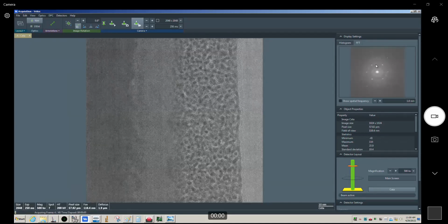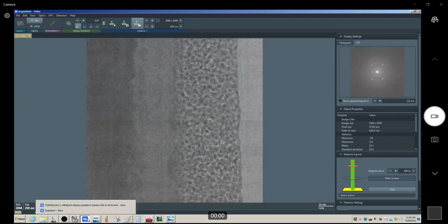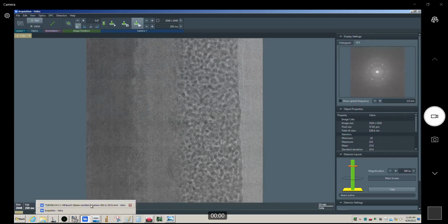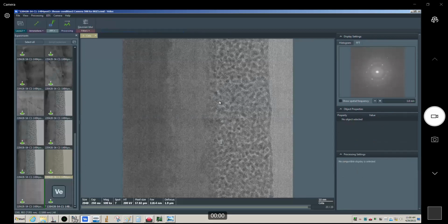Okay, so you can already see the difference here. Yeah, I think you have to make sure that at least within each individual frame, you've got something to work with. If the overall signal per frame is just too low, then it's just not going to work well. Okay, so this should probably work a little bit better.